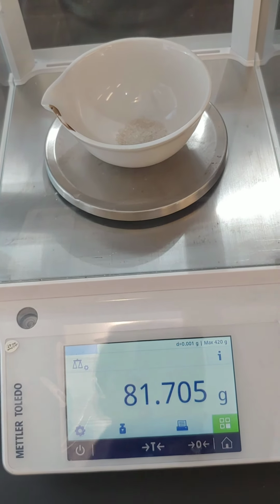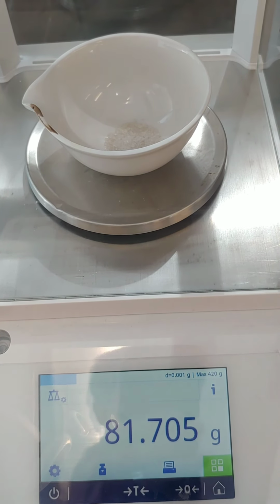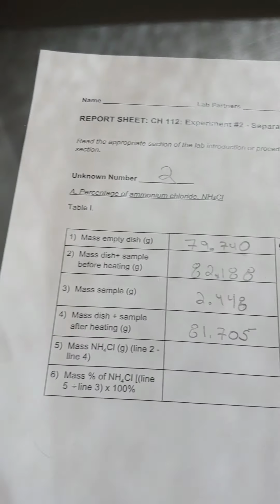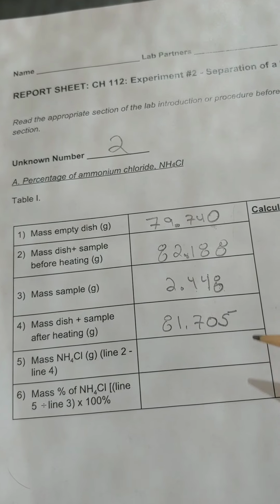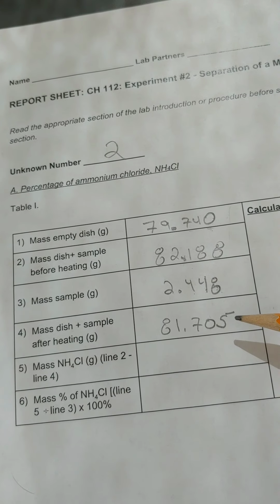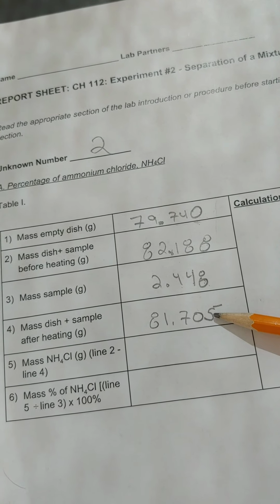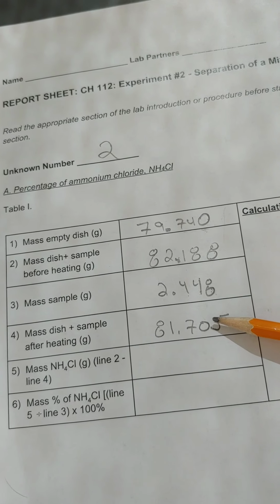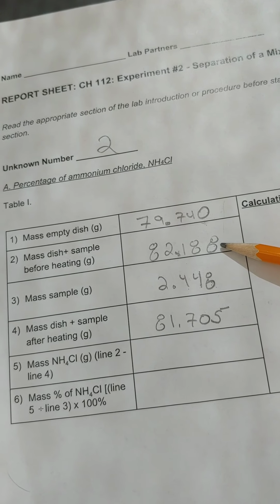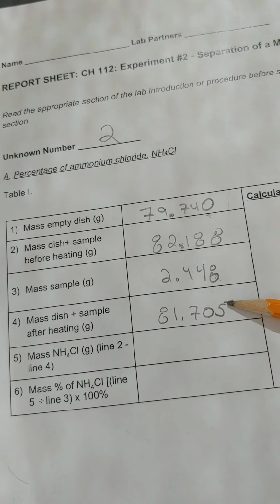Welcome back. I have now weighed my evaporating dish after I've allowed it to cool off. So this is after part one, where I've sublimed off the ammonium chloride. So if I come to my table, I can say that my mass of my sample is 2.448 grams, and now after heating, the mass of my dish and sample is 81.705 grams. So the mass of the ammonium chloride is going to be this value here, 82.188, mass of dish and the sample before heating, minus the mass of the dish and the sample after heating.